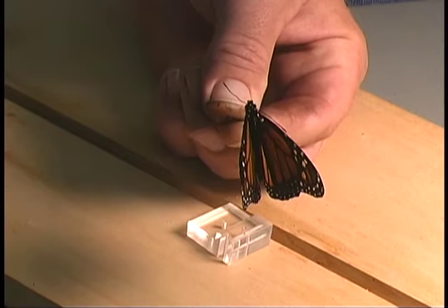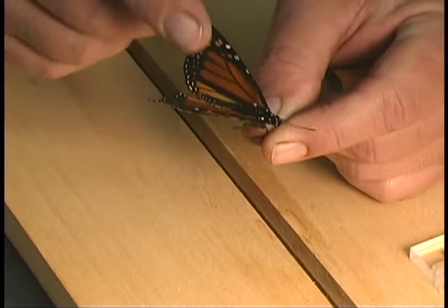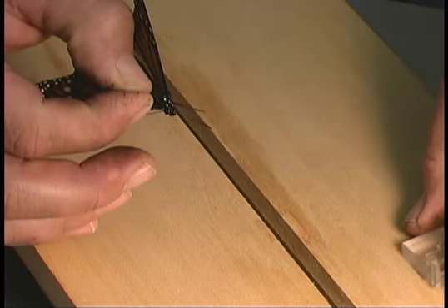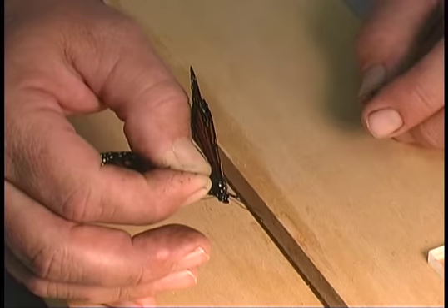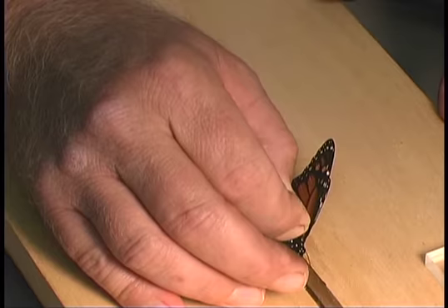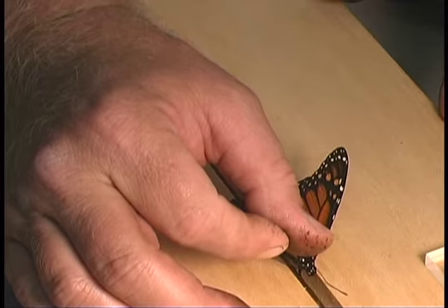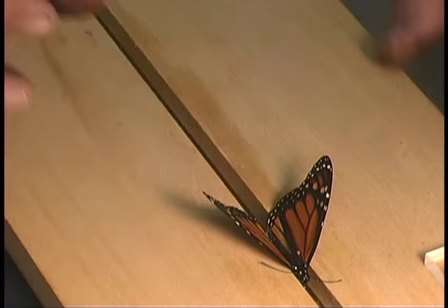If the pin is crooked going through the insect, it's difficult to get the wings properly mounted on the spreading board. Once you have the pin inserted through the insect's thorax as straight as you can get it, grasp the top of the pin and insert it into your pinning block from the bottom side — that will position the insect at the proper height on the pin. Then place the pin into your spreading board at the foam bottom in the center, and visually inspect the insect from the side and front or back to make sure the pin is going straight into the bottom. That way the insect wings will be positioned properly when you get ready to move them forward.